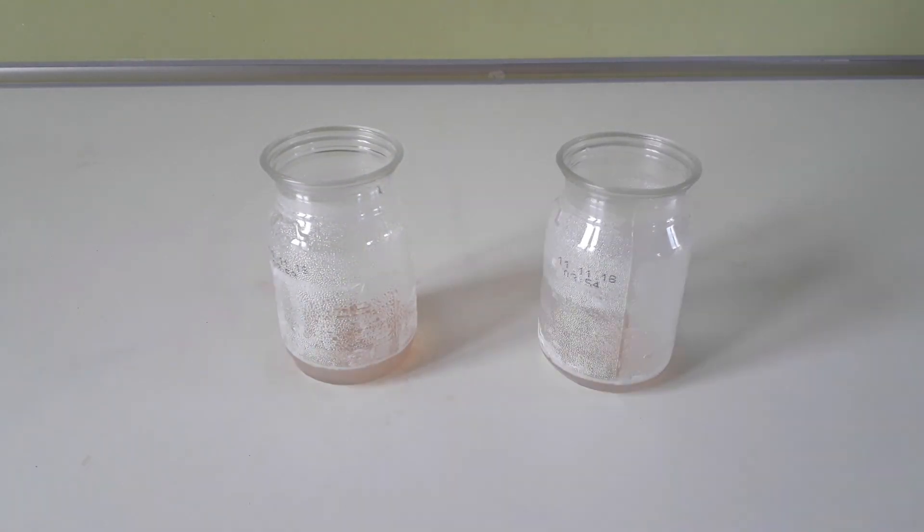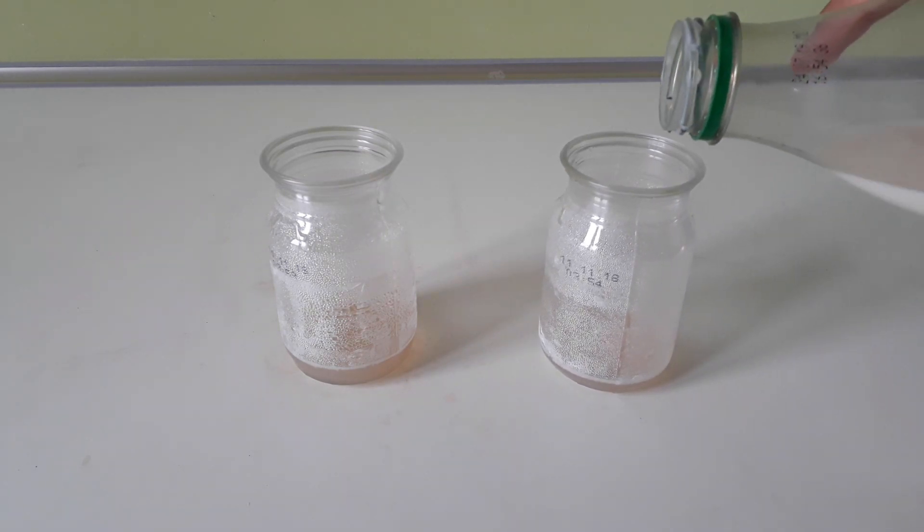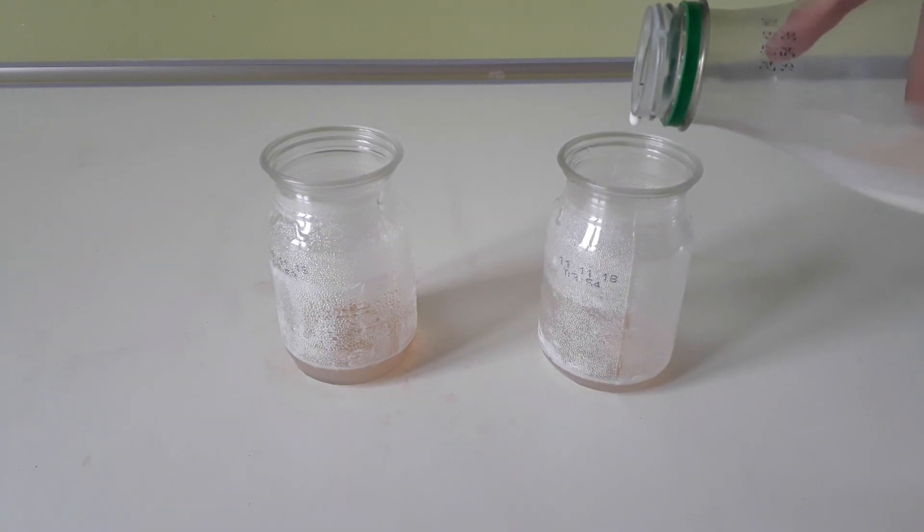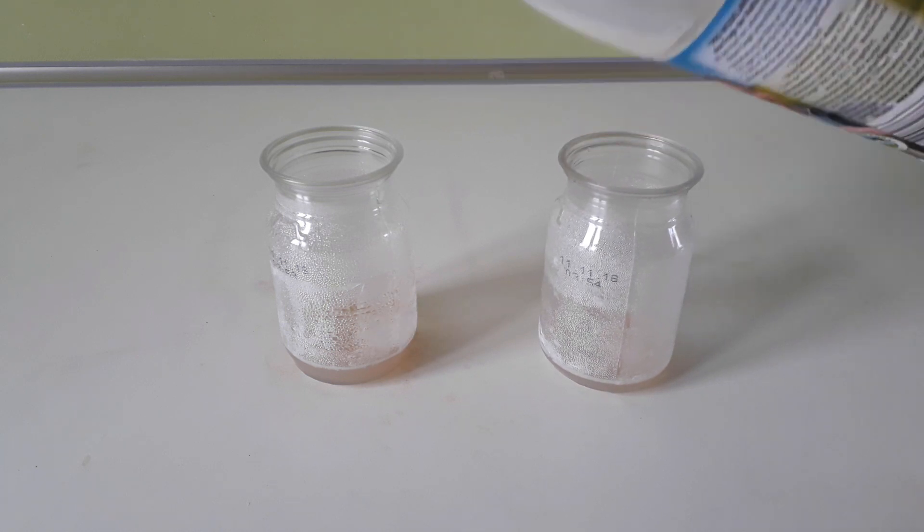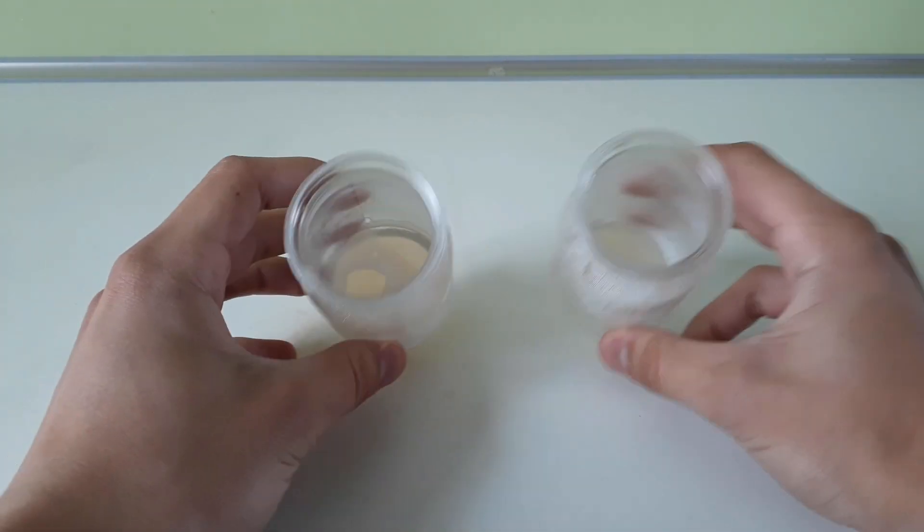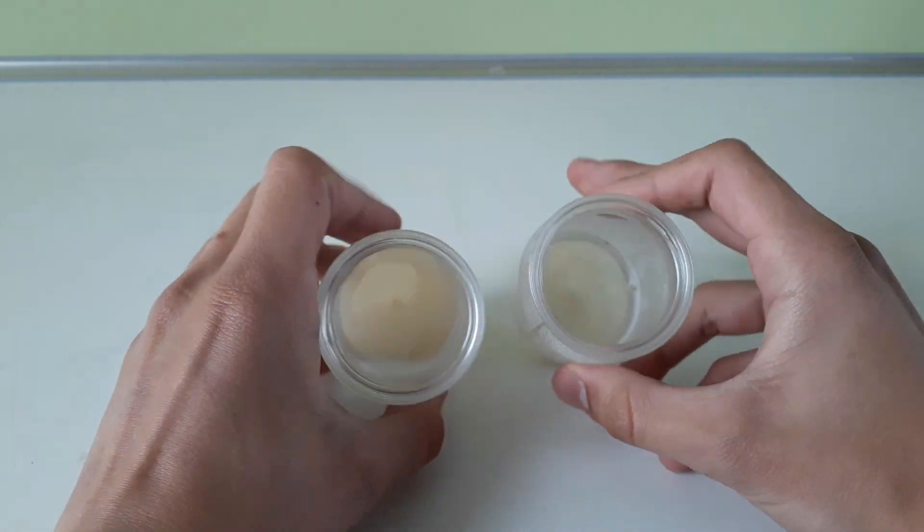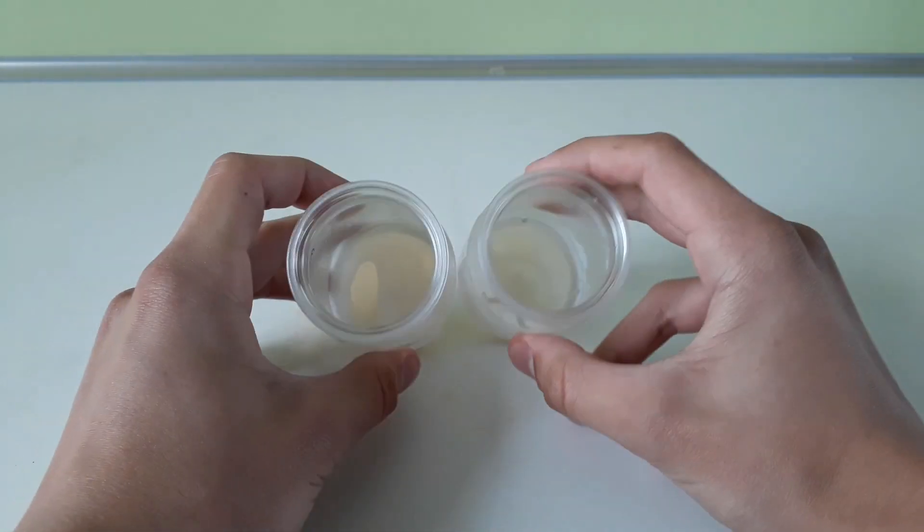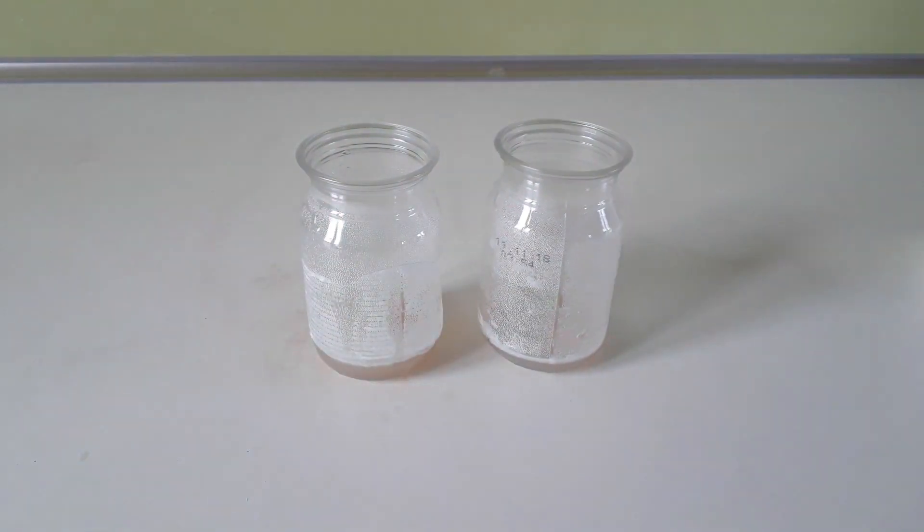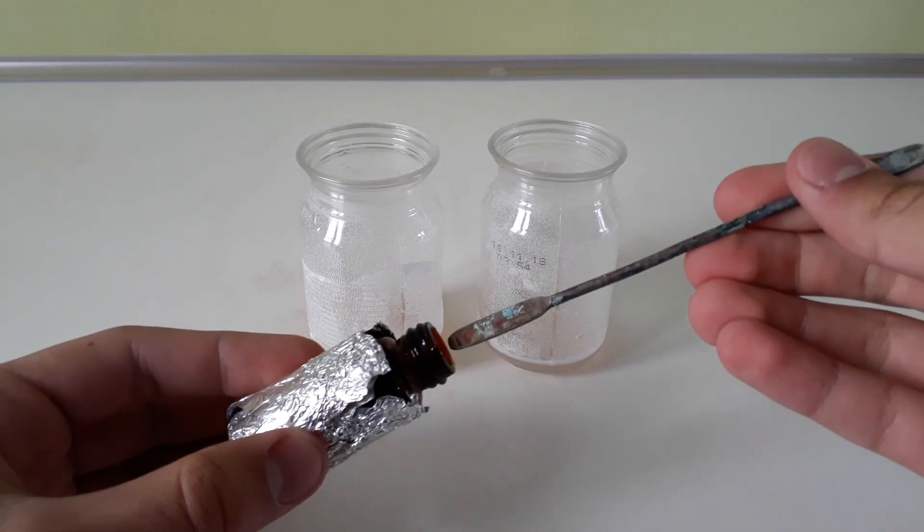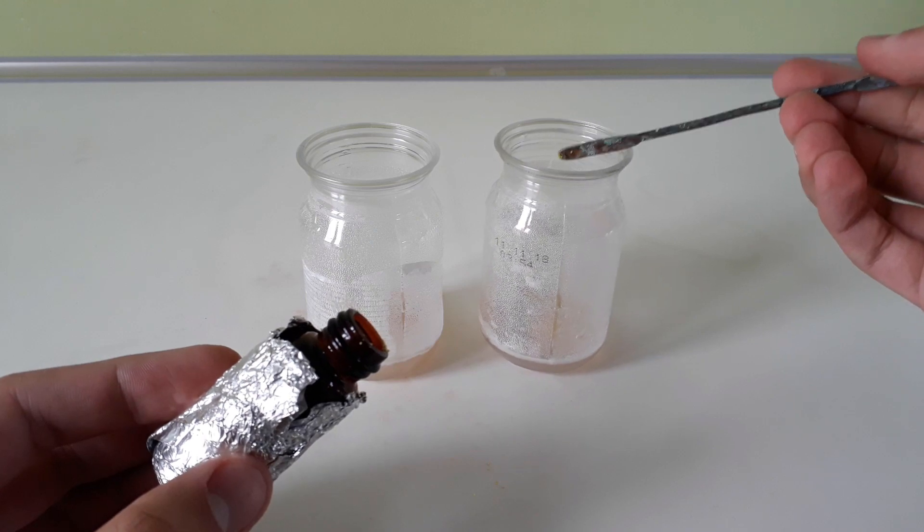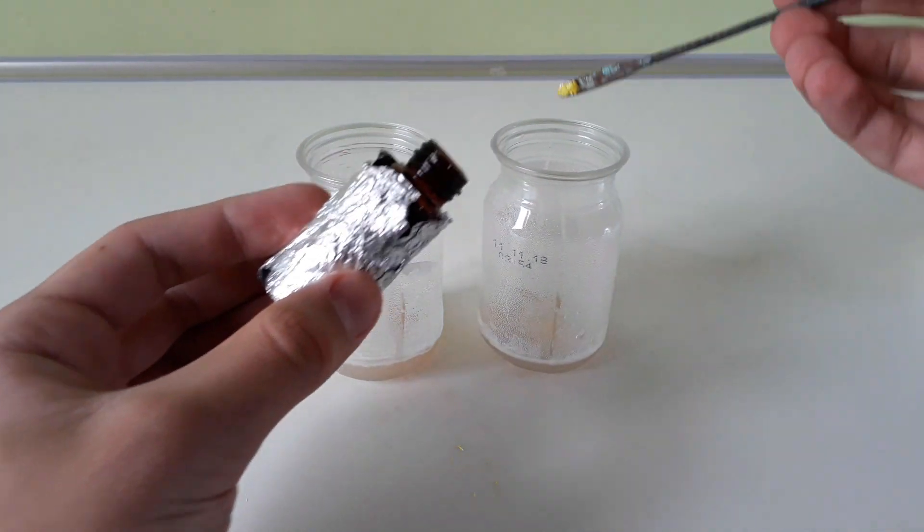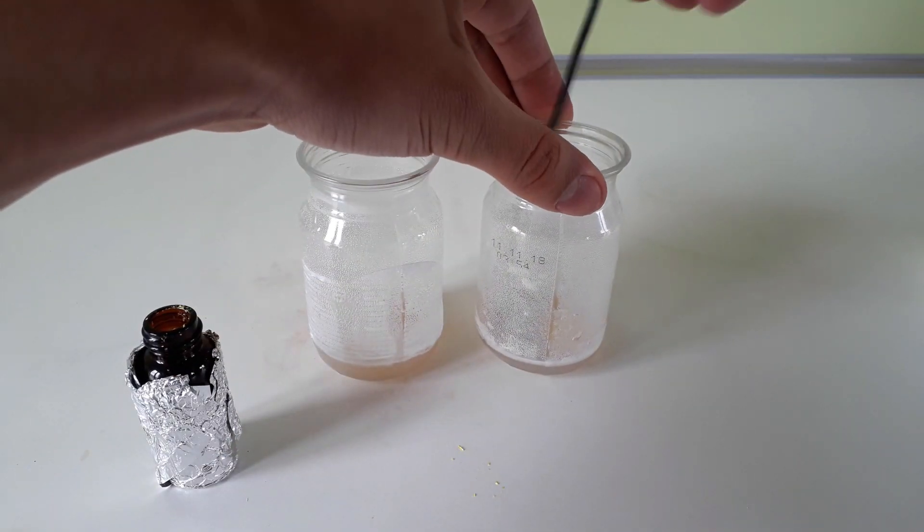After the agar water had solidified, I added a couple drops of milk into both of the cups. The left cup is the control cup and into the right cup I add the iodoform. I put the cups in a dark place and wait for about two weeks.